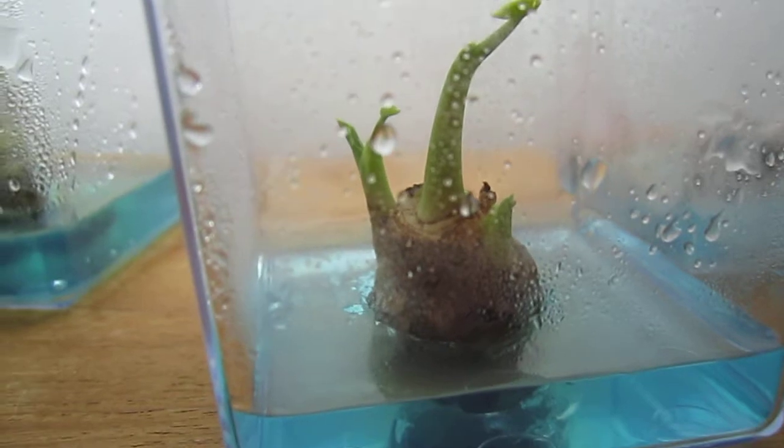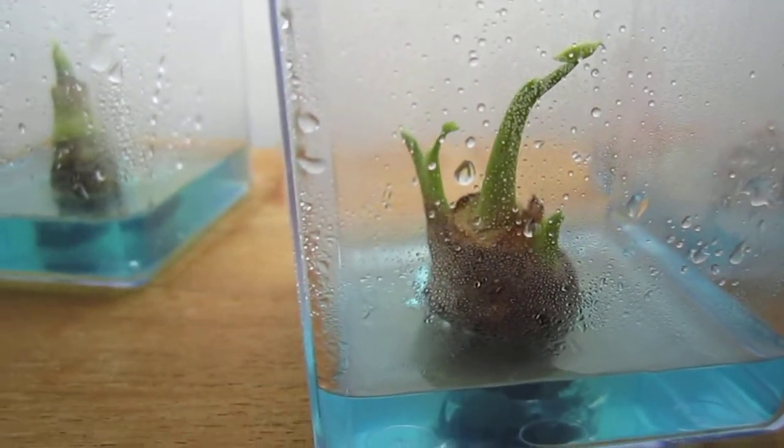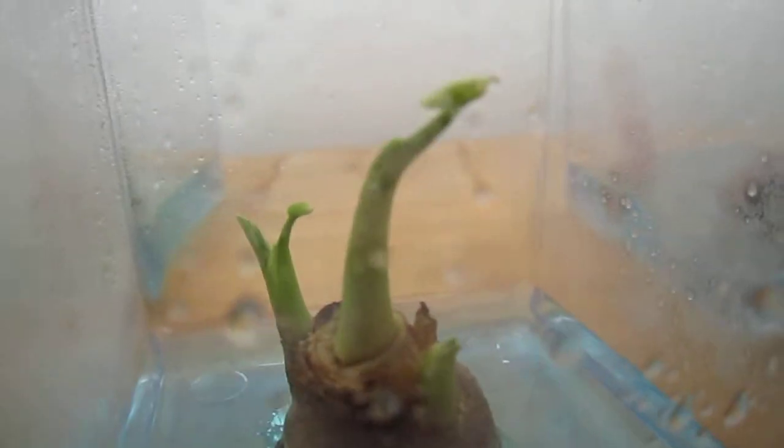I plant tissue culture of Moy. If you notice, you can see the little baby shoots coming out, the bimba shoot. This was planted on August 8th, and today is August 20th.